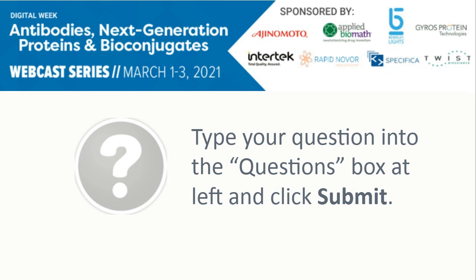We have a proteomics technique for deriving the, how do I say this? We've developed internal wet lab techniques on the mass spec to derive the full length sequence, and then pair them. I'm happy to talk a little bit more in detail, perhaps offline. But the easy way to put this is we're doing a top-down approach. We developed some techniques in-house for faithfully recapitulating that binding activity of the cognate pair.